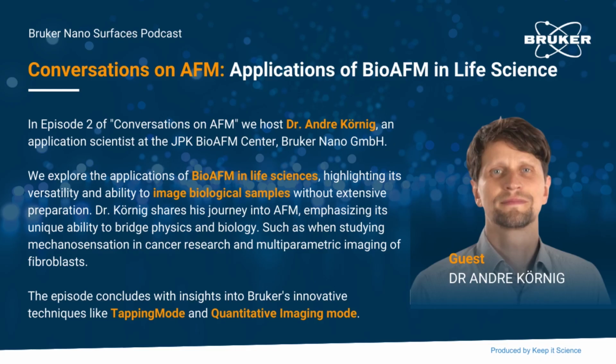Awesome. So now I want to move on a little bit more to speaking about BioAFM and Bruker Nano, and the technologies that you use specifically and that are developed in-house. One consideration is that AFM is used in industry, materials, and life sciences. And one very special thing at Bruker Nano is obviously the tapping mode. Could you maybe explain what that is to our listeners?